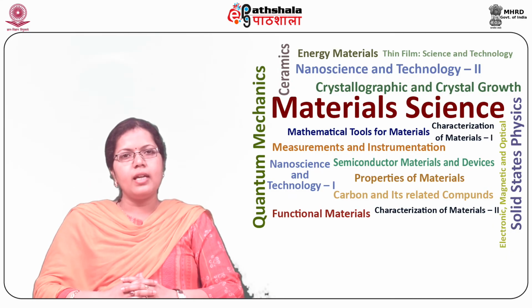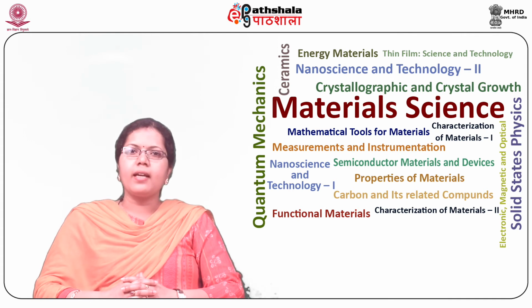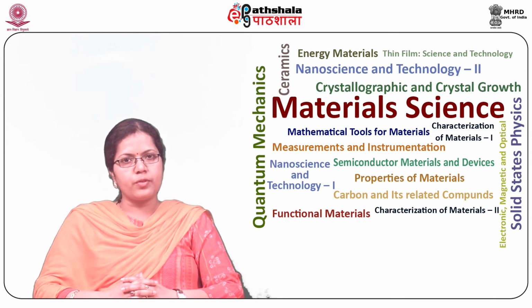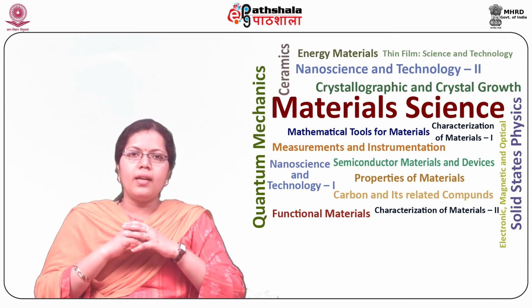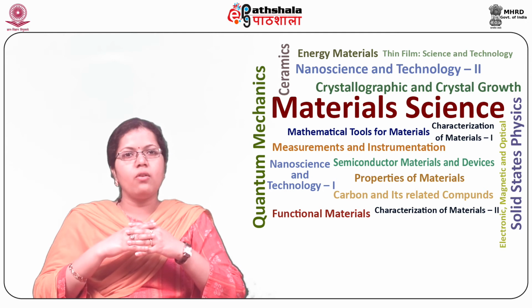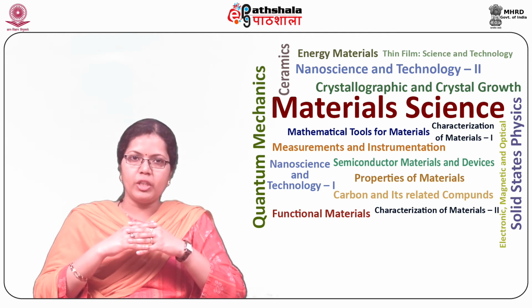Now students, let us study about its applications. This technique is used in biological and medical research, such as cytology and histology. It can be employed to study living cells, tissues, and microorganisms which remain transparent in bright field illumination.